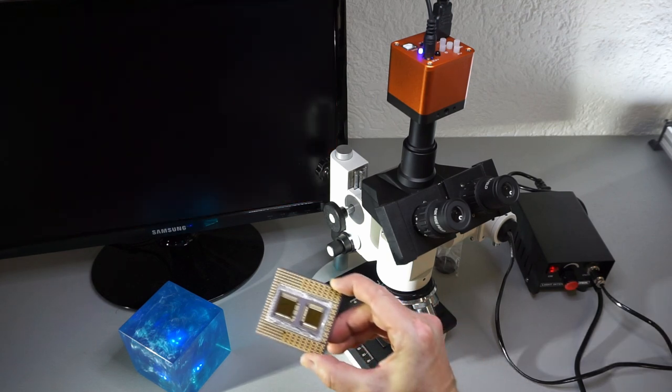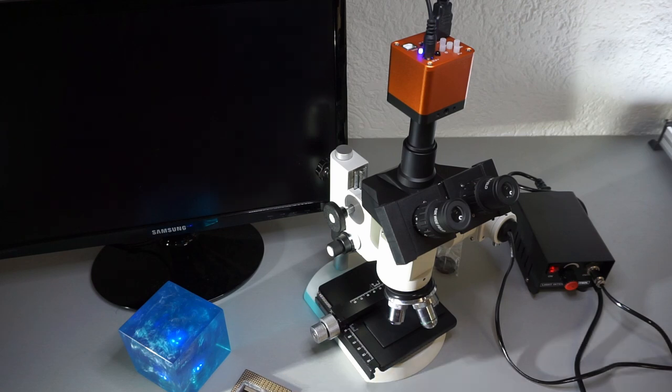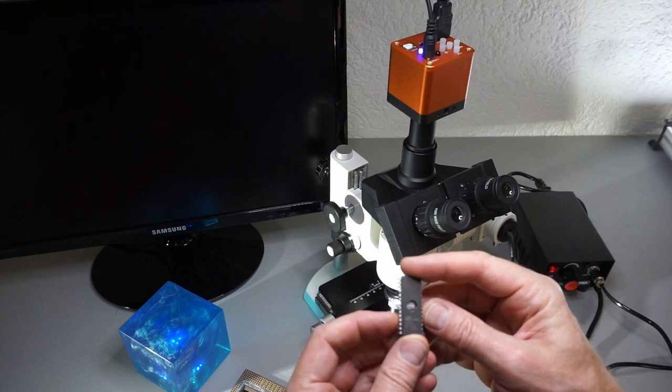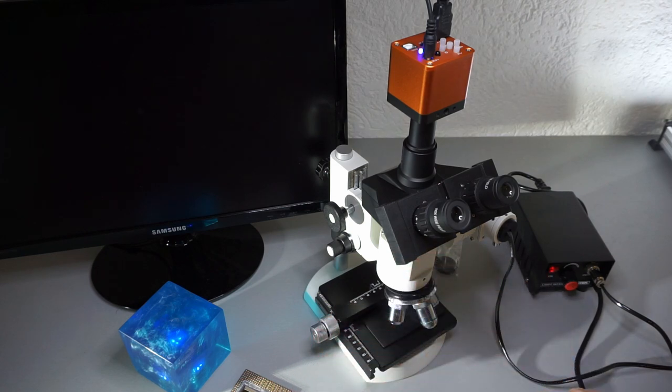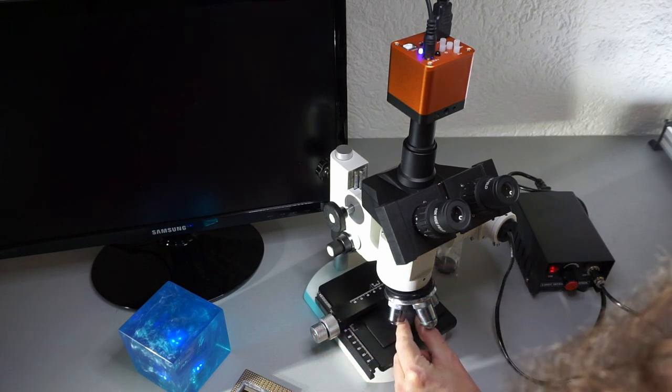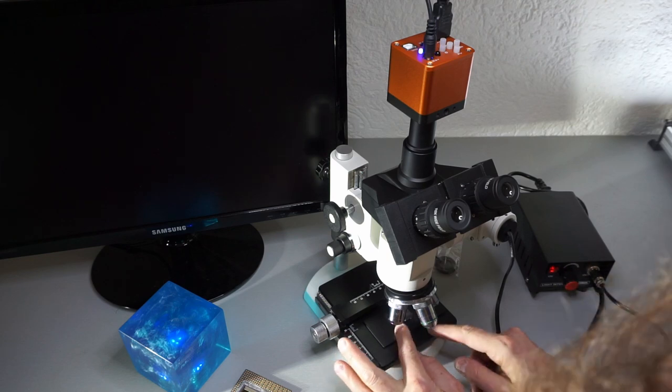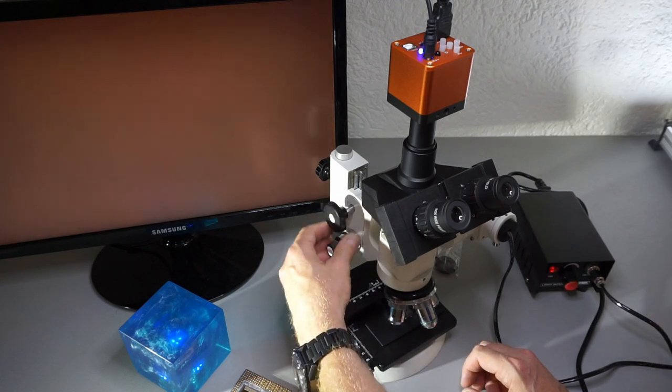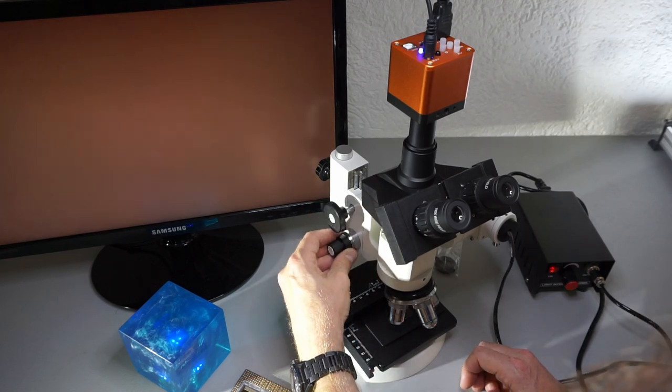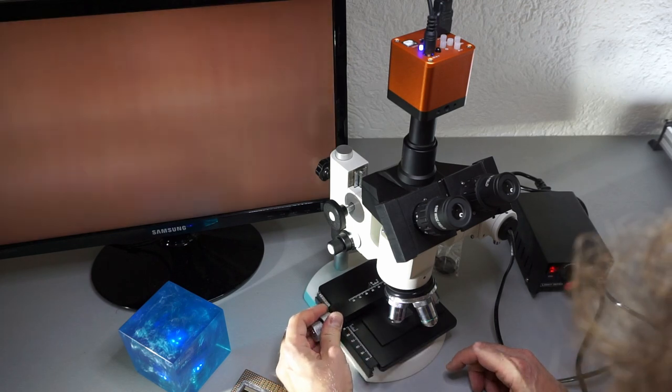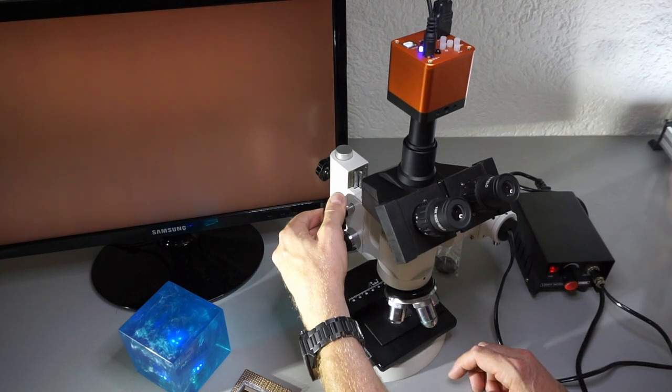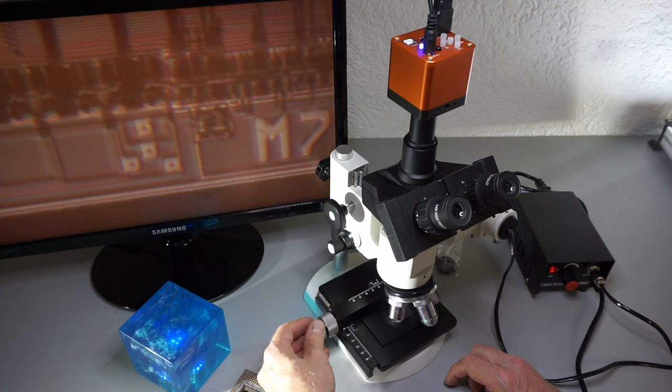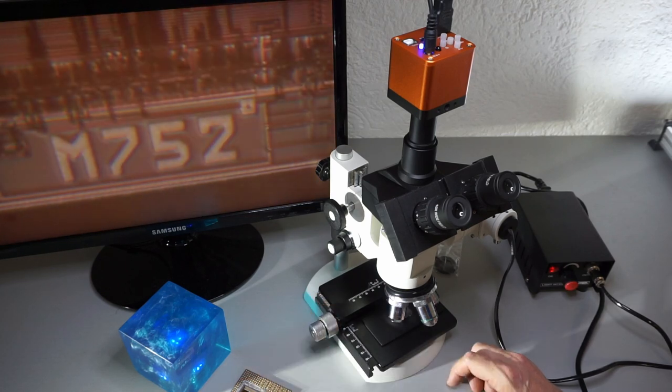Let's remove this one and let's maybe have a quick look at this ST DEPROM. I'm installing it here. It has a different distance, it's a bit higher, so I have to probably adjust a couple of things. Let's move it into the right area.